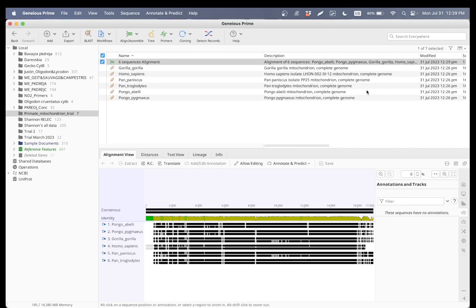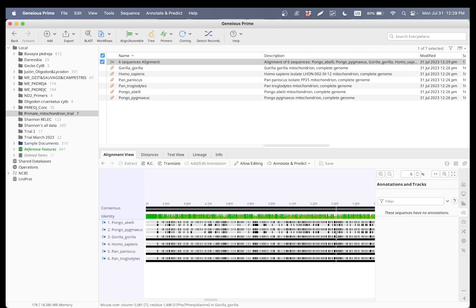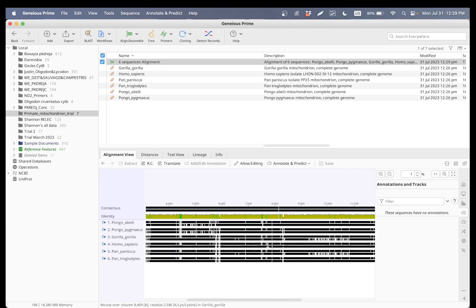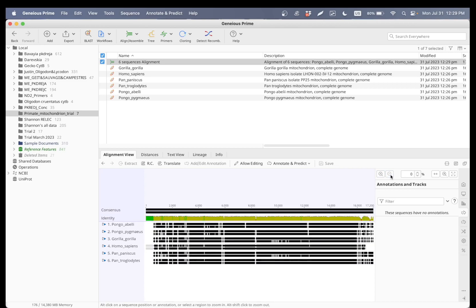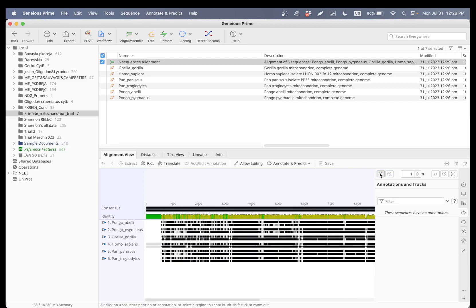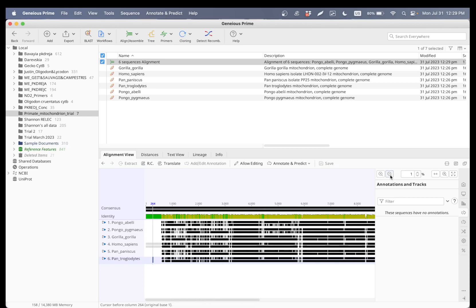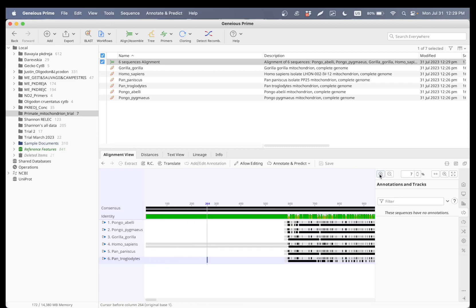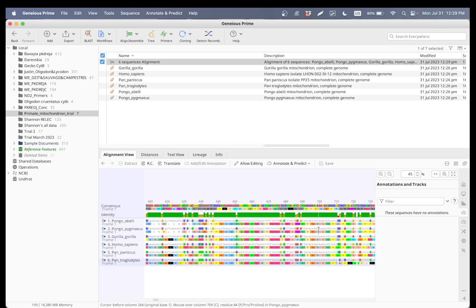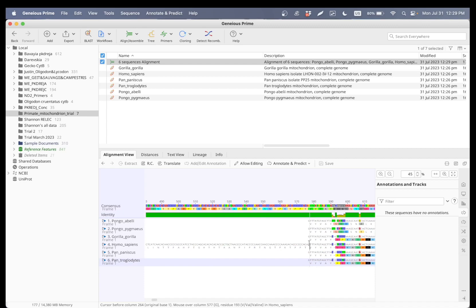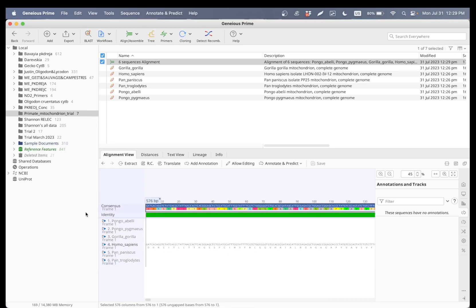All right, so the alignment is done. It looks like the Homo sapiens has a head start. What I really like about Geneious Prime is that you can edit these sequences super easily.